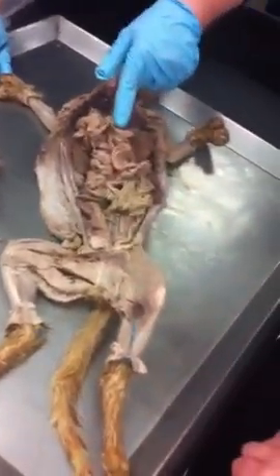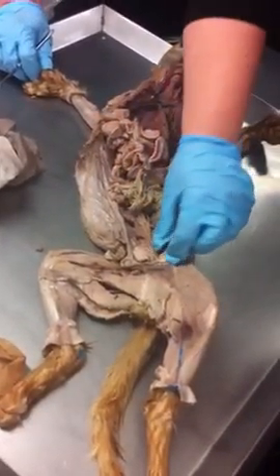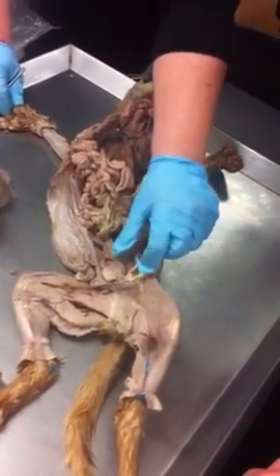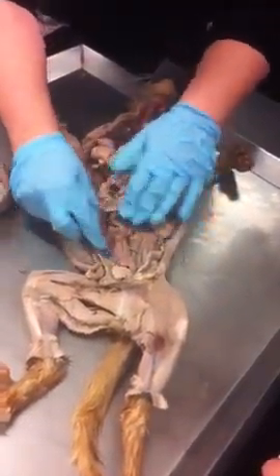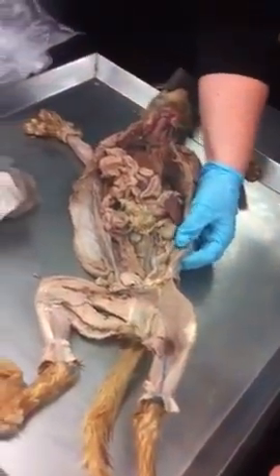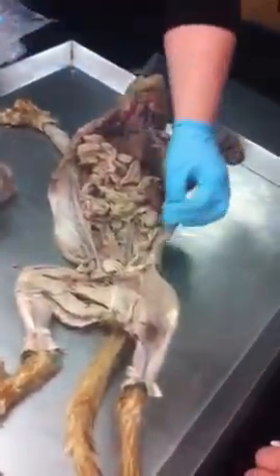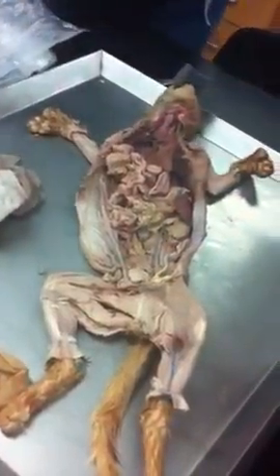Is this a girl or a boy? So here's a uterine horn. Don't make a mistake in calling this the fallopian tube. It's the uterine horn. And of course there's one on the other side. Here's the ovary. And that little thing, like a wrist and a hand wrapping around it, that's the fallopian tube. So ovary, fallopian tube, uterine horn.